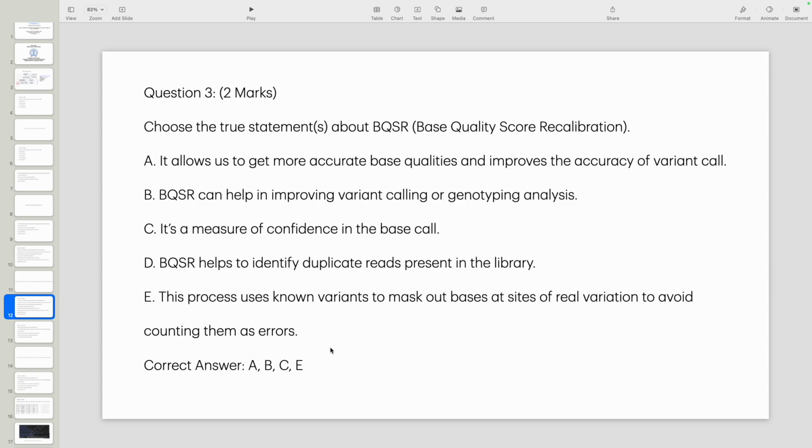Madam, this will work only for the known variants, right? For novel variants, it might not work, right? Yeah, it won't work for novel variants. If we are getting a novel variant, we look into other parameters. We look into the duplicate number, the read number, and the quality. We look for all the combinations as well. It depends on what your objective is, so we can do whatever we would like to do.